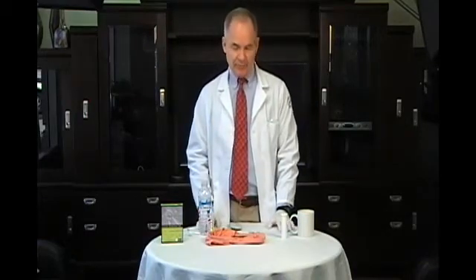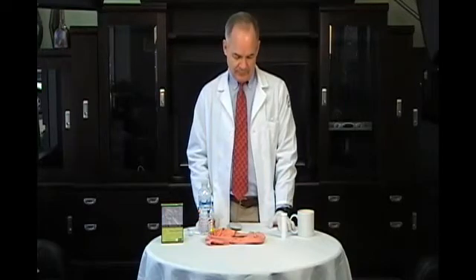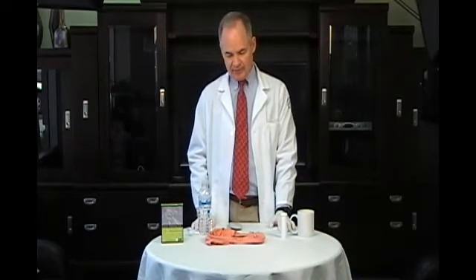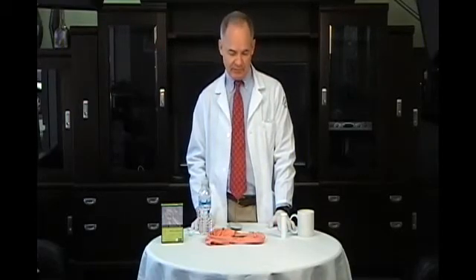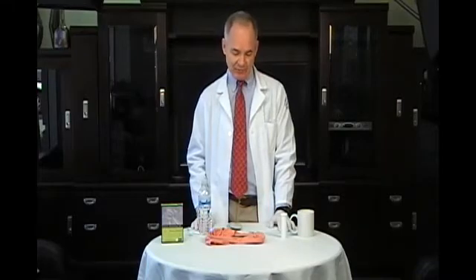This method for detecting semen was first described by Babson in 1959. It relies upon catalytic hydrolysis of naphthyl phosphate by an enzyme found in semen, acid phosphatase, which catalyzes the hydrolysis of naphthyl phosphate to naphthol, which then reacts with the diazonium salt to form an intensely colored blue dyestuff.